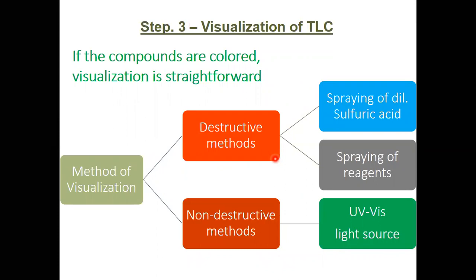How can we know the distance traveled by the sample? If the sample is colored, then the visualization is very easy. If the sample is not colored, then there are different methods of visualization. We can divide these methods into destructive and non-destructive methods. What is the meaning of non-destructive? For TLC plates, a UV visible light source is used as a non-destructive method. The TLC plate can be visualized under the UV light source.